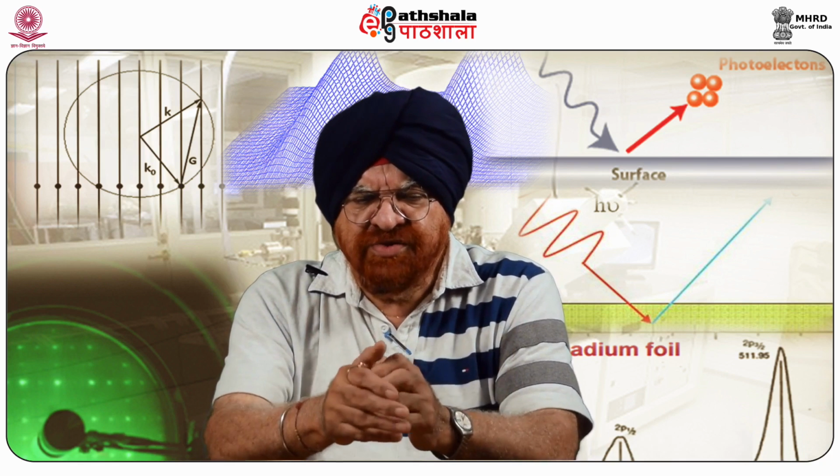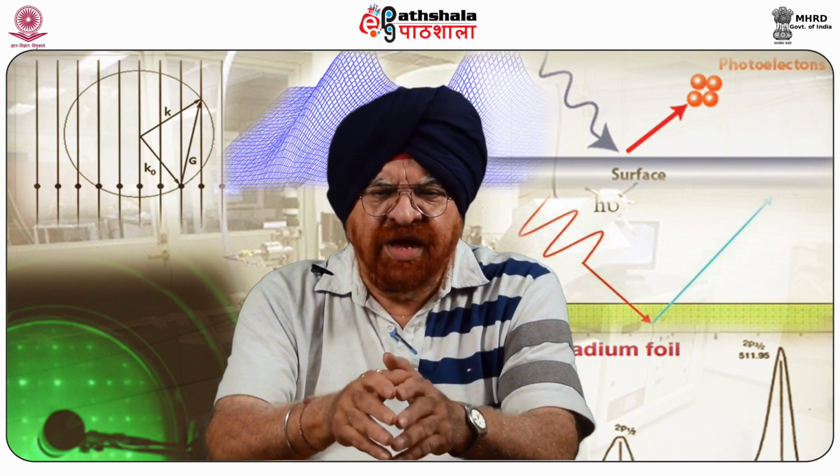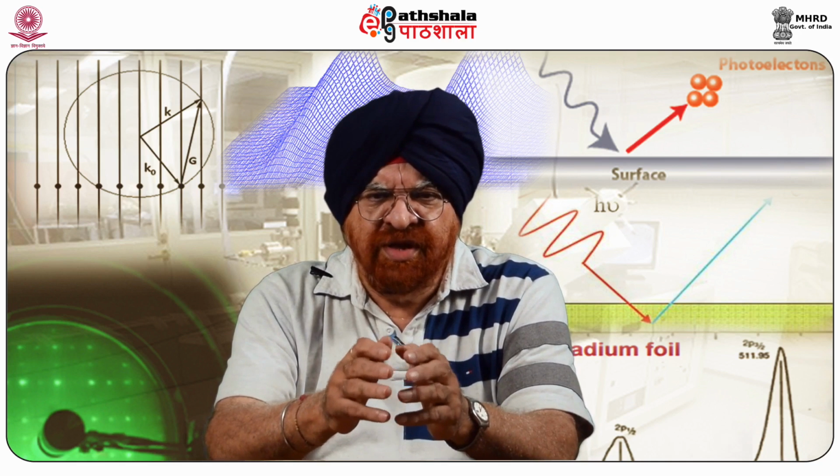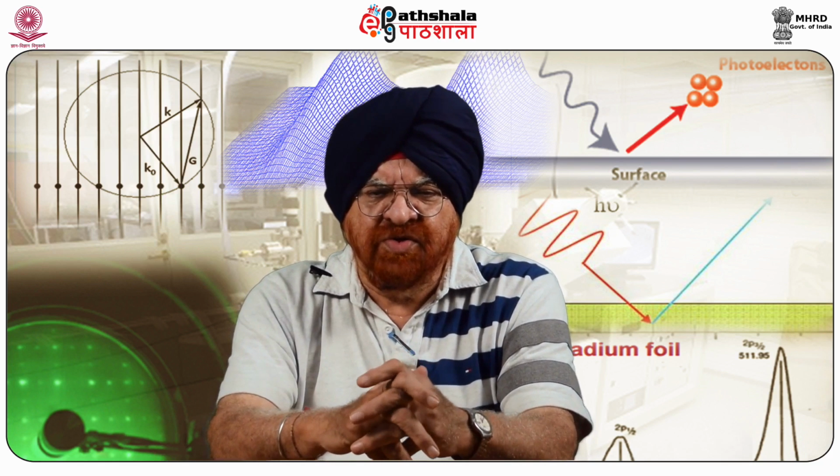As I have said, this is basically a surface analytical technique, and very precisely one can find out what exactly is there on the surface and to what extent it is there. That means it provides us both qualitative as well as quantitative data.